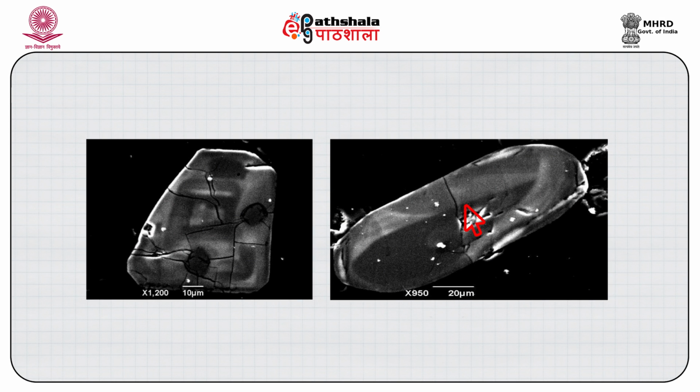Inelastic scattering also produces long wavelength radiation in the visible range as well as in the IR and UV range, and this spectrum produces very useful images of cathodoluminescence. Now, in these two figures, the cathodoluminescence images of zircon are seen, and one can distinguish different stages of growth in zircon as well as some included particles, and one can distinguish the magmatic and the metamorphic.